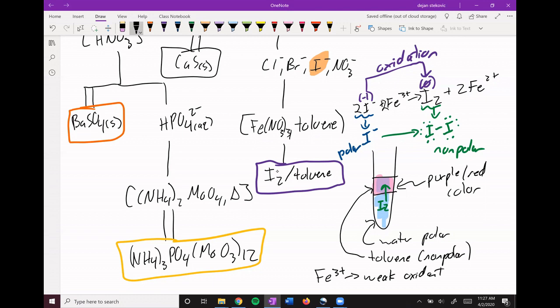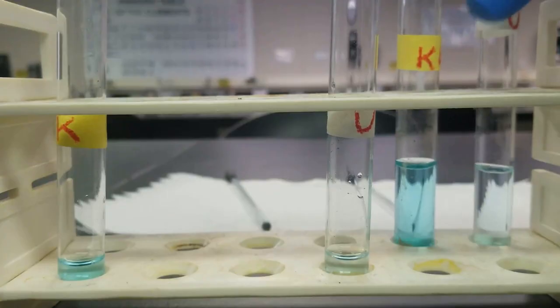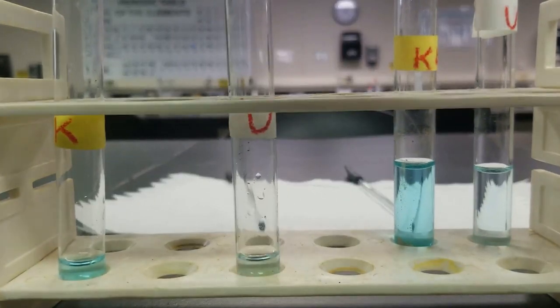Unfortunately, at this point, what you'll see in the video is some kind of mistakes were made. And so this section of the lab, kind of the wheels fall off a little bit. So if you pay attention, the solutions kind of change a little bit, but the footage is decent. I'll fix it later on, maybe next semester. But for now, we're just going to say it's good enough on these two.